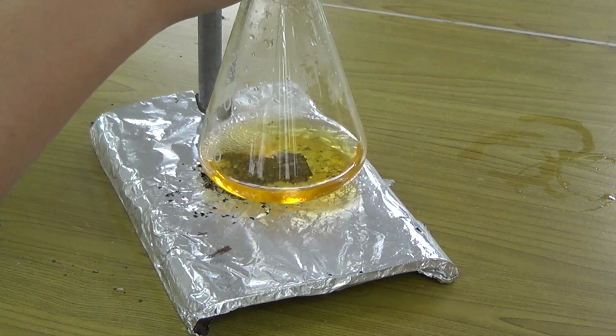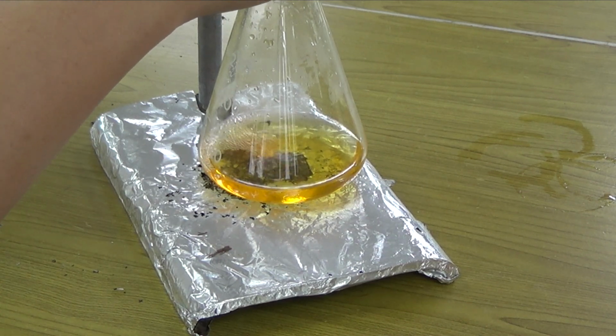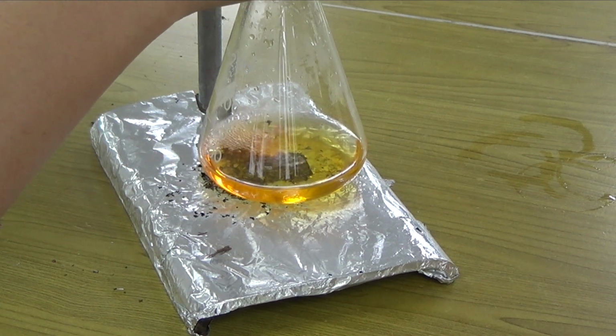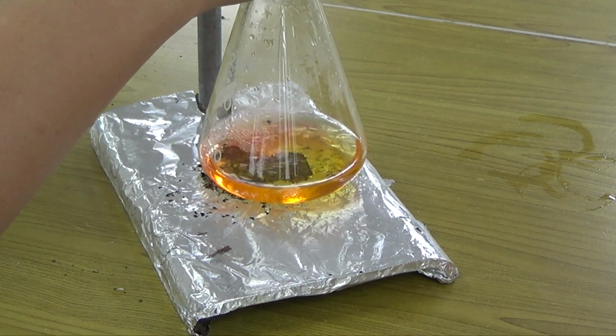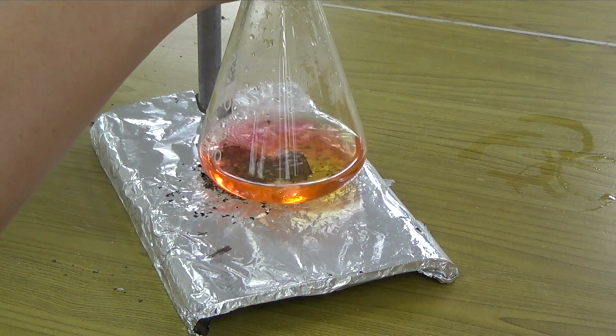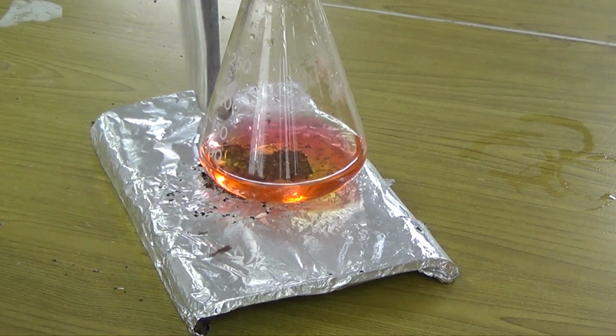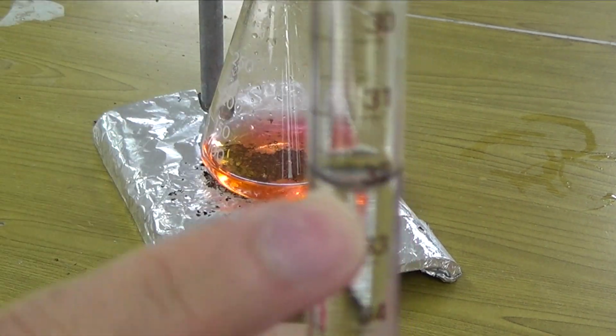Then I'll do drop by drop just to be exact, because we know we are getting closer to the end point now. We could do this because we roughly know where we are fishing out the titre. So I'm going to wait until it goes to 32, then I will stop. So now it is at 32. The burette volume is at 32.